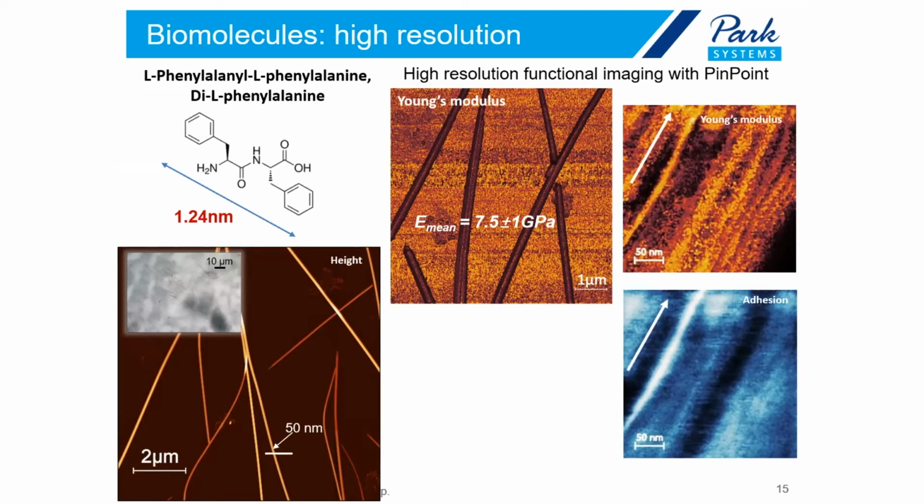But an interesting thing is, as you zoom on top of that peptide structure, and here are the images on the right, you can actually do high-resolution nanomechanical imaging in a so-called pinpoint mode, where you collect fast force maps, and you can resolve some interesting structural motifs in both Young's modulus and adhesion. And I will talk a bit more about what actually we're seeing here.